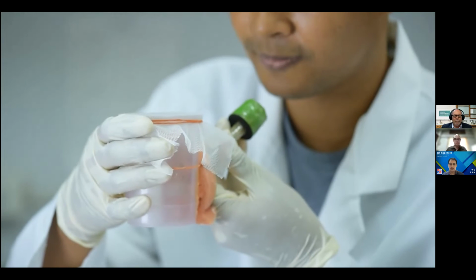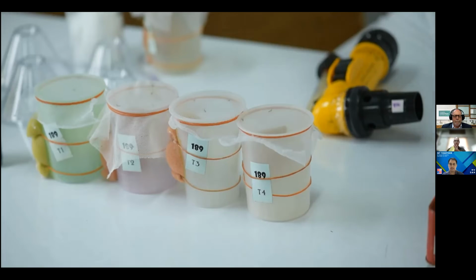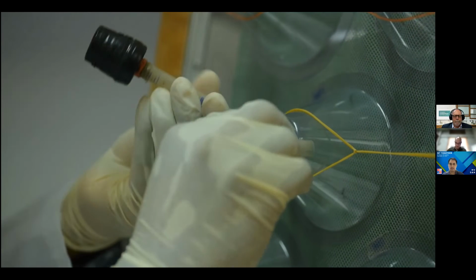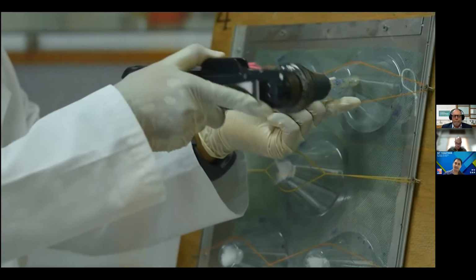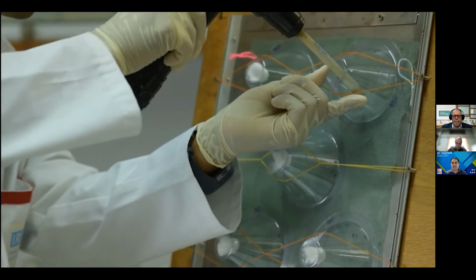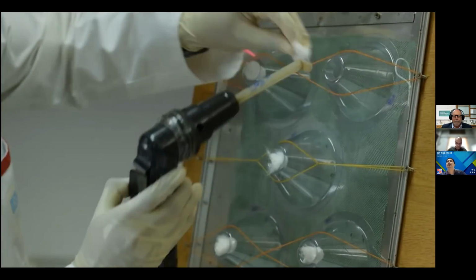Now repeat the same procedure with the remaining control cones until you have completed a total of 10 control cones, each having 5 female mosquitoes. While you have been doing the tests, make sure you have spaced the cones in a way that you get good representative coverage of the net or the wall or whatever surface is being tested. Now repeat the entire exercise for the treatment or test cones on the treated material.